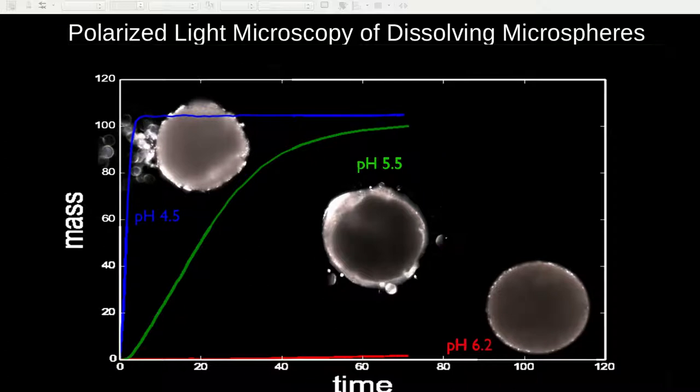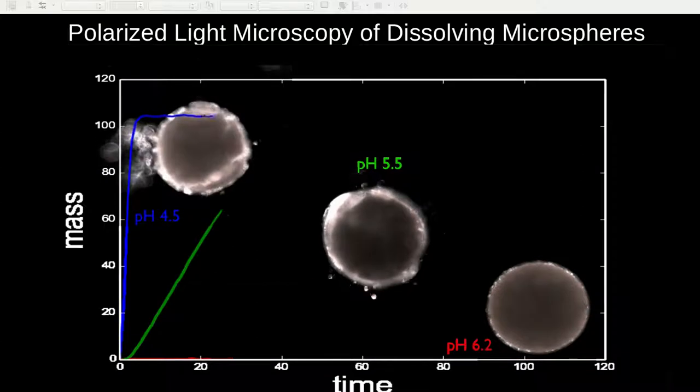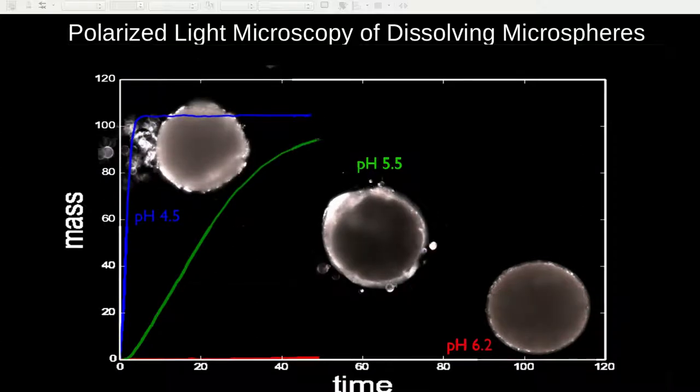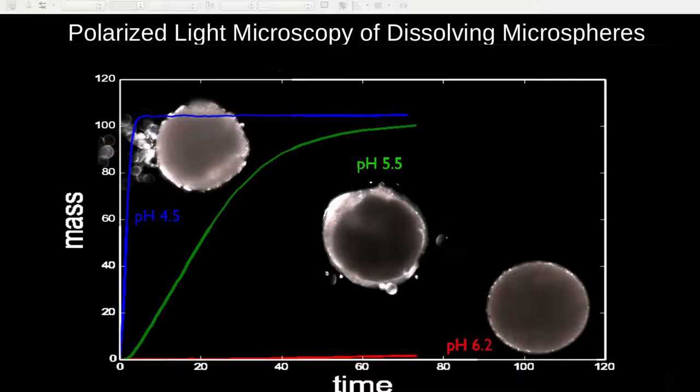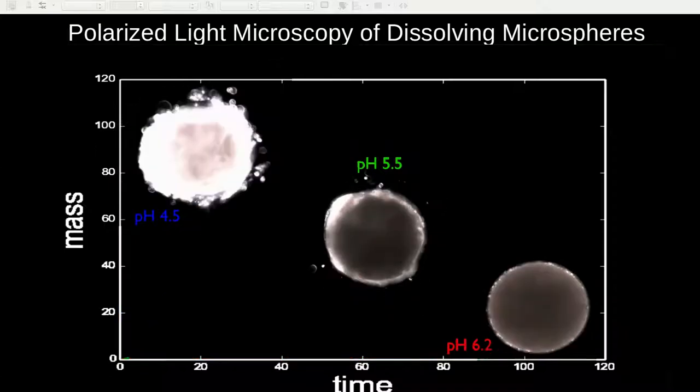The following shows polarized light microscopy video of the microspheres dissolving at various pH conditions. Overlaid on the PLM video is the mass of API released as a function of time as measured by traditional dissolution bath measurement.